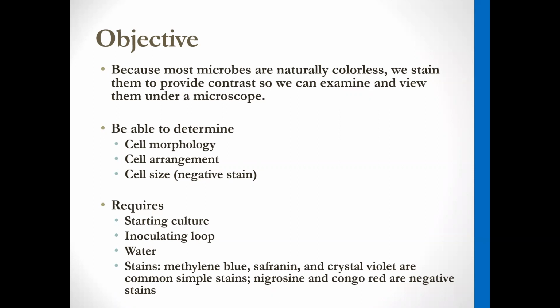So in order to make a smear, you're going to need your microscope slide, some water, and your culture, and then the stains. Now, I'm not going to quiz you on what's required. These are just some of the more important items. You'll also need your Bunsen burner to do aseptic technique. Some labs use air dryers to help speed up some of the steps. But the things you really need are the cells you're going to stain, your inoculating loop, and then the stains. Those are the real important things. You can't make a smear and do staining without those materials.